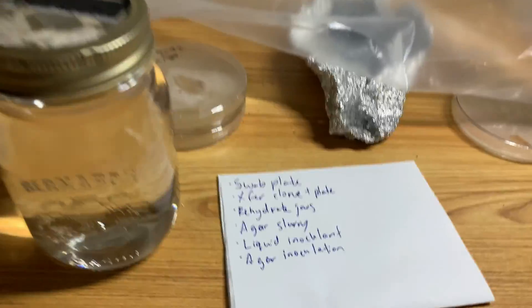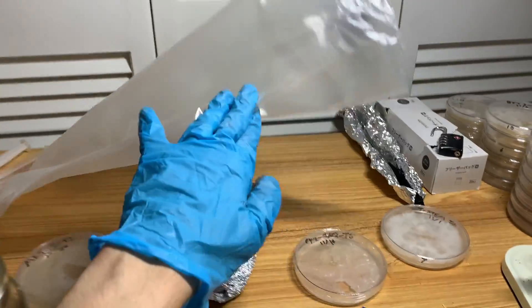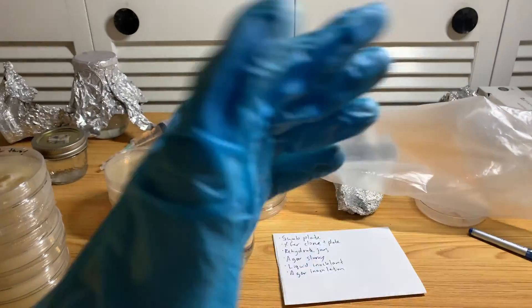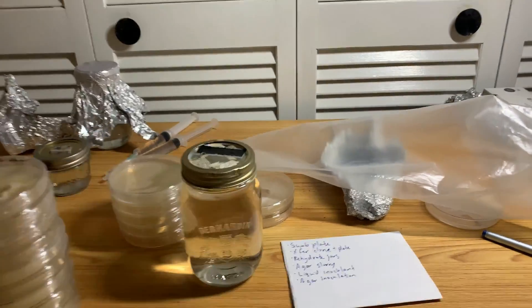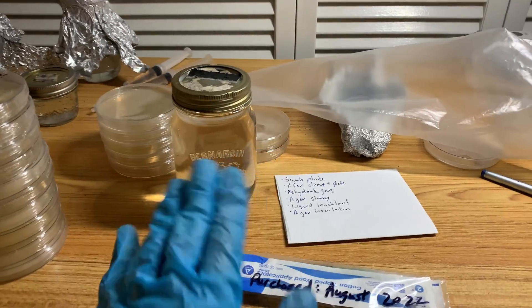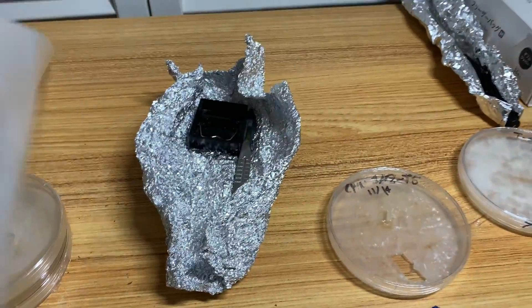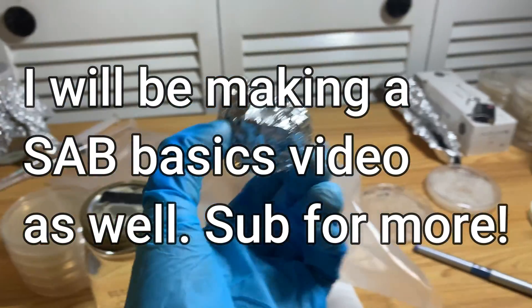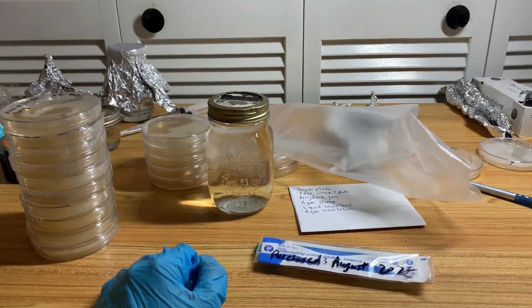So I've got everything set up here. I'm going to put everything in the order I want inside the SAB to prepare, then clean up this table and prepare the SAB the usual way: wipe down the walls of the SAB with ISO, wipe down the table with ISO — just as a precautionary thing. Then put everything I want inside the SAB: my foil, my scalpels, and my cling wrap that I'm going to use to wrap the plates.